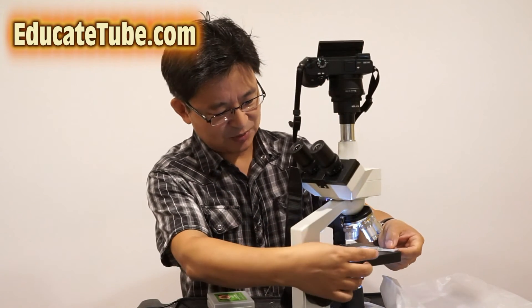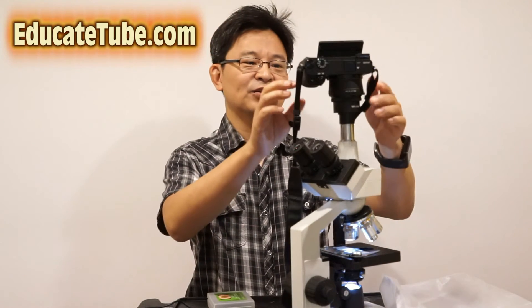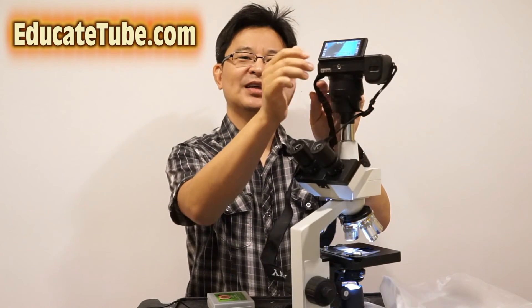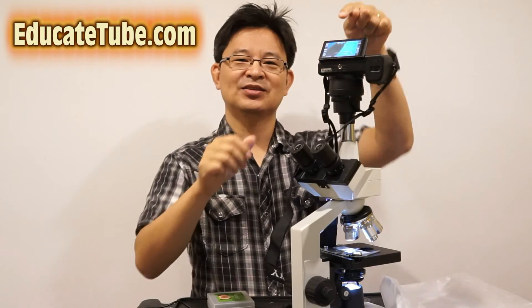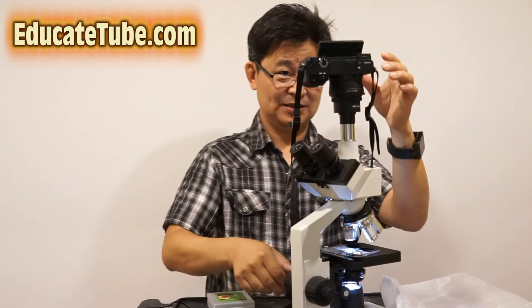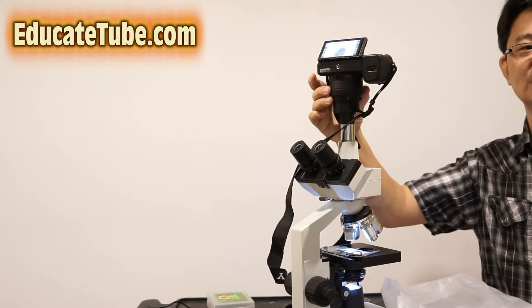Later on I'm going to show you how to make your own slide. For now, let's put this one in. The cool thing about this is I can look through the stereo ocular lens, or I can look through the LCD screen — and I'm going to go with the LCD screen for now.